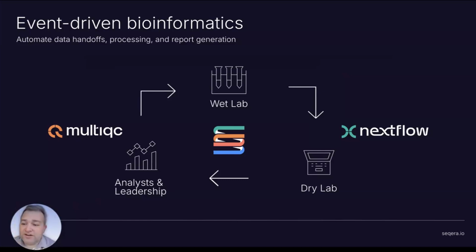Instead of producing our images and reports through ad hoc processes, we can use a tool like MultiQC, another Seqera open source tool, to generate these automatically and have them available. And all of this whole process is orchestrated by Seqera Platform.